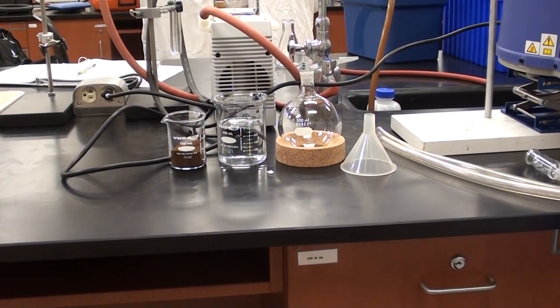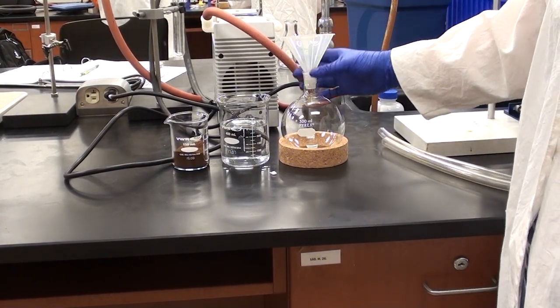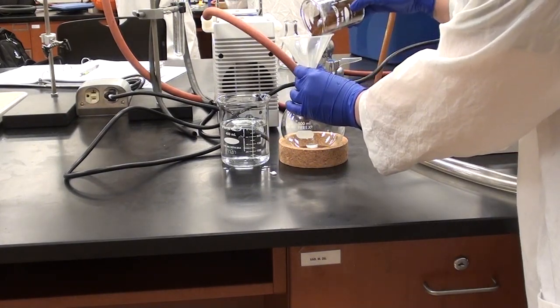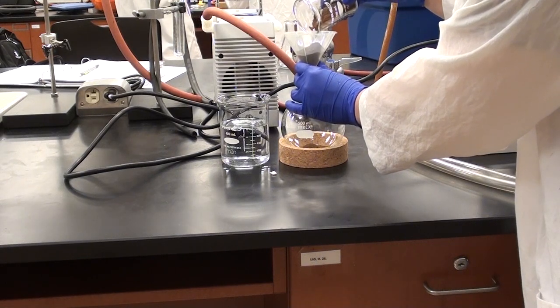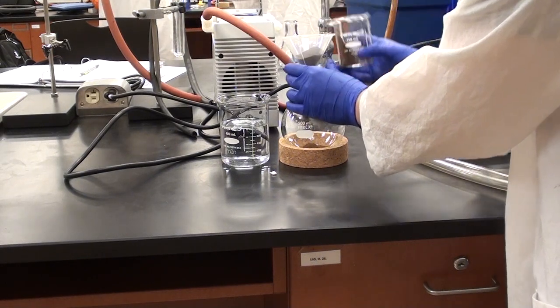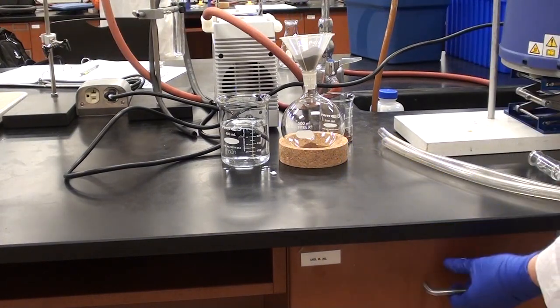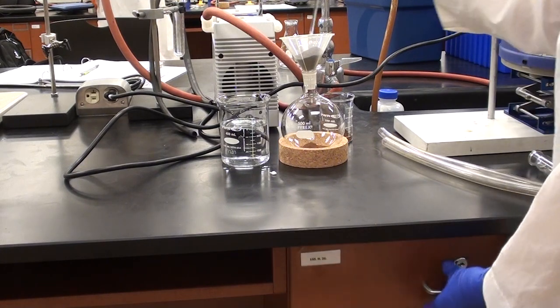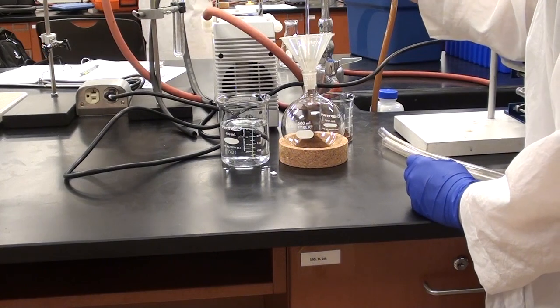So Cassie's weighed out the cloves, and now she's going to add the cloves to the round bottom flask. She's just going to go ahead and pour that in. She's using a powder funnel, which is a really good technique. You might need to use a spatula to push that through, or possibly a stirring rod.